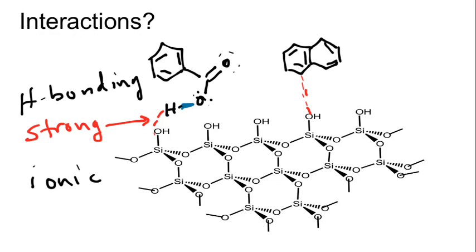If we now shift over to our other molecule, naphthalene, we still have our ionic force coming from our silica, or our stationary phase. We want to evaluate now the intermolecular forces possible for naphthalene. So for naphthalene, we'll go through and look at all the bonds. We've got carbon to carbon, which by definition has to be covalent, because it's the same atom. There's no difference in electronegativity. And then we also have carbon to hydrogen, which is easy to forget because we've got implied hydrogens all the way around there.